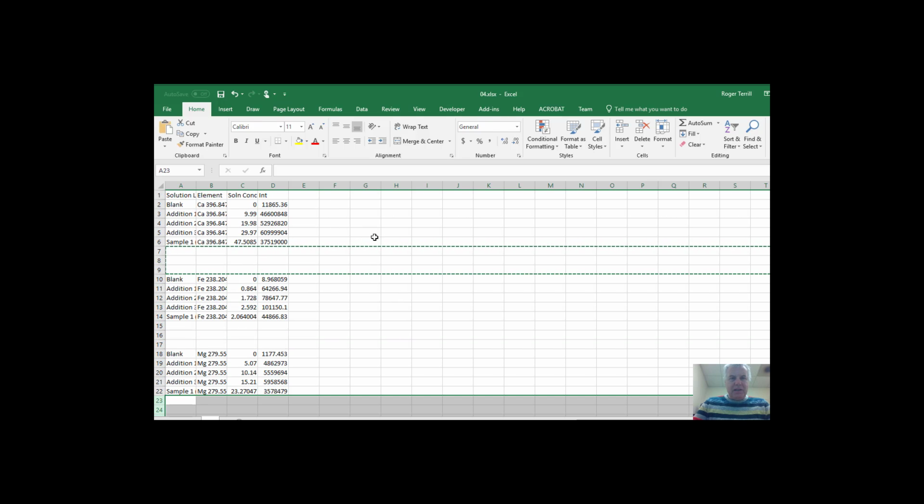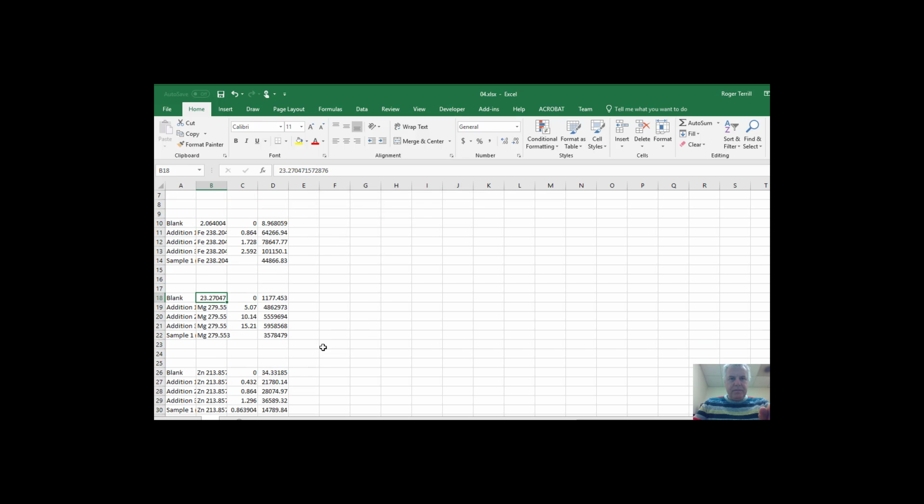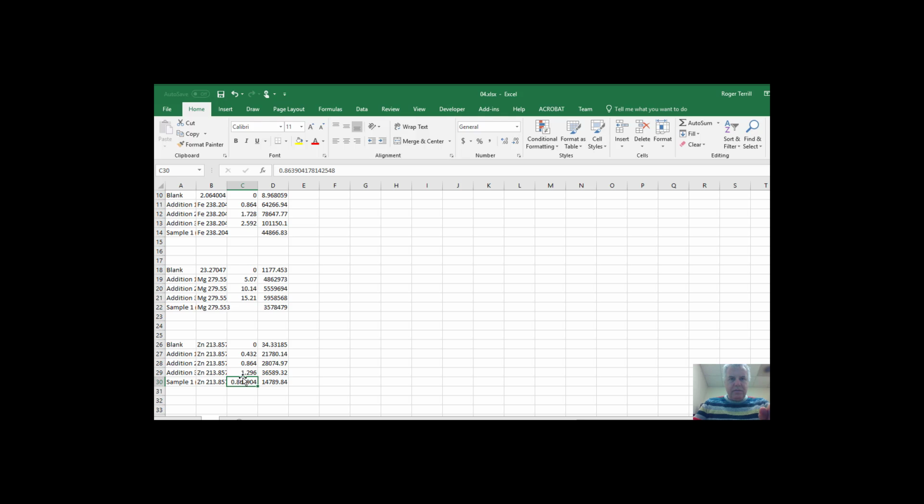All right, so now we've got some cosmetics to do here. First of all, we're going to take this value here, and this is the calculated concentration that the software got. And I'm actually going to put this guy up in the corner. Let's put this up here. And let's put this guy up here. And then this guy up here.